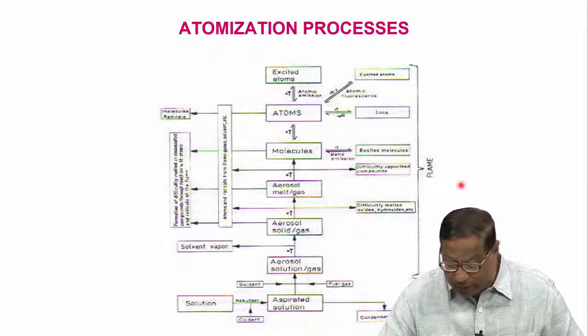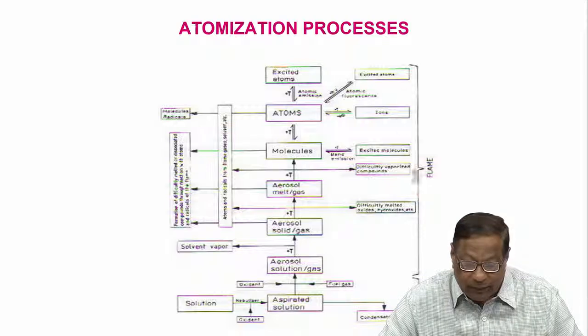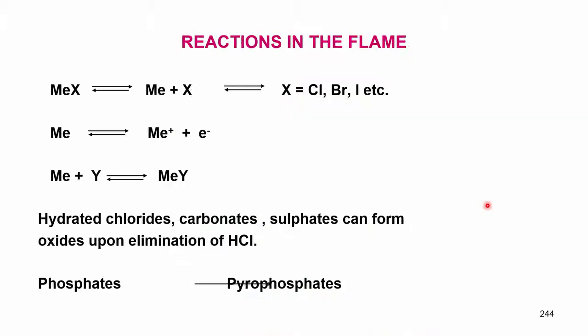So, this is how the whole thing is organized. In this area there is burner-nebulizer interaction, and this area completely describes almost all the reactions that take place in the flame. Okay. So, what are the reactions in the flame?